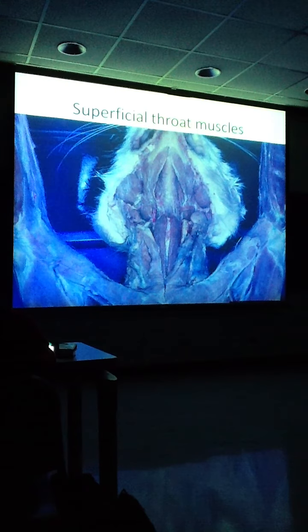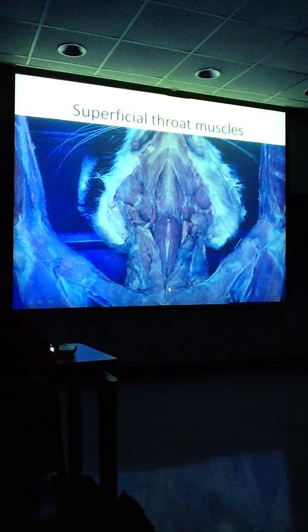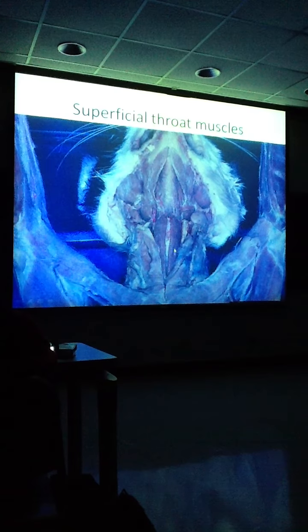If that's mylohyoid, Mr. Gilmore, now I lost my arrow. I hate that. Now, Mr. Gilmore, I need you to tell me, what's this little small fellow right here? His name is stylohyoid. Stylohyoid. Mr. Gilmore, if that's stylohyoid, I want you to walk me through, if I came from the sternum to the hyoid, we're going to call him sternohyoid.